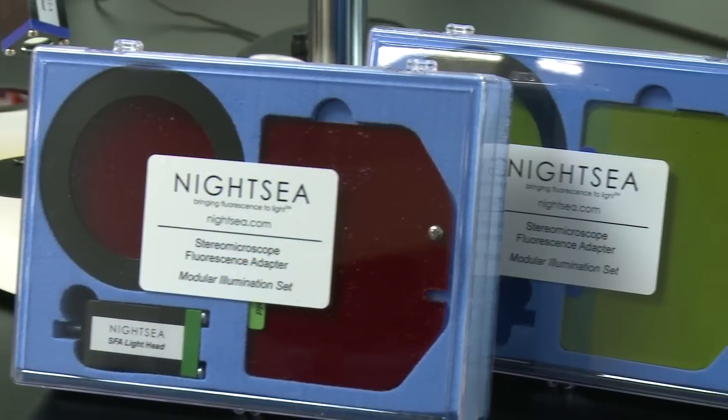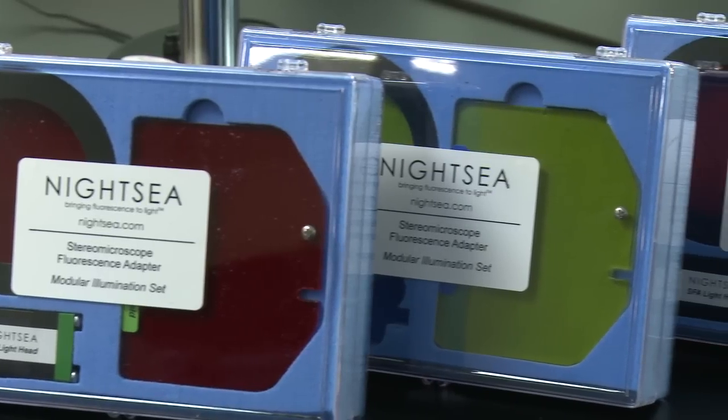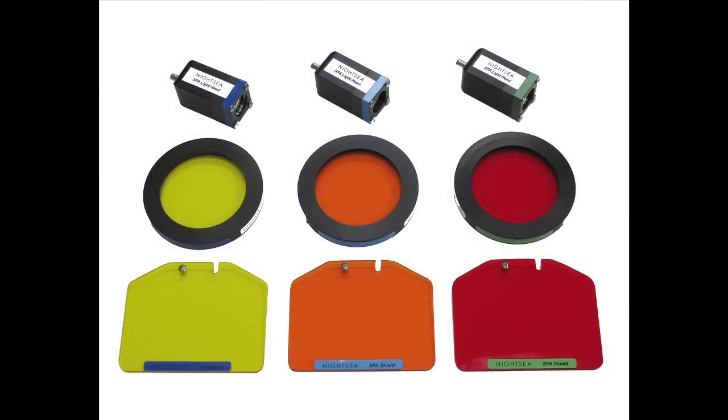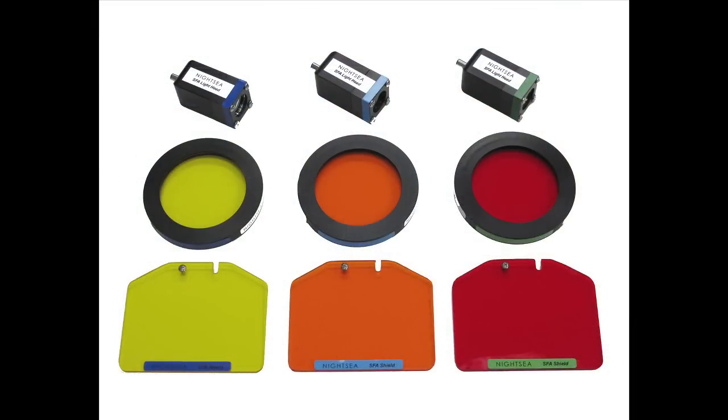To switch between colors, you remove the shield, the filter, and the illumination module, and replace them with a new set. The illumination modules and filters are color coded so that you can easily keep track of which ones to use together. You can start with one color and add others as needed.